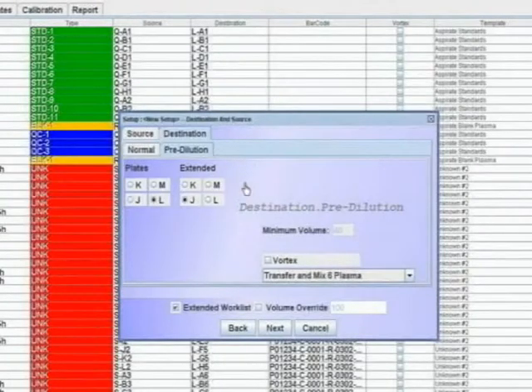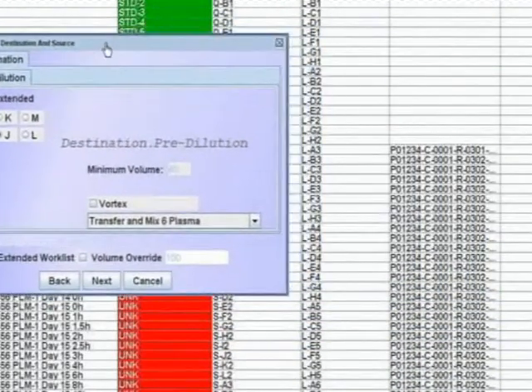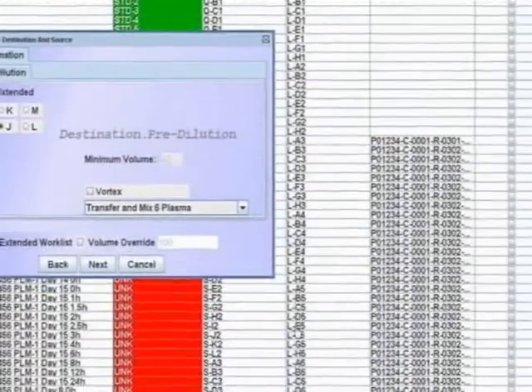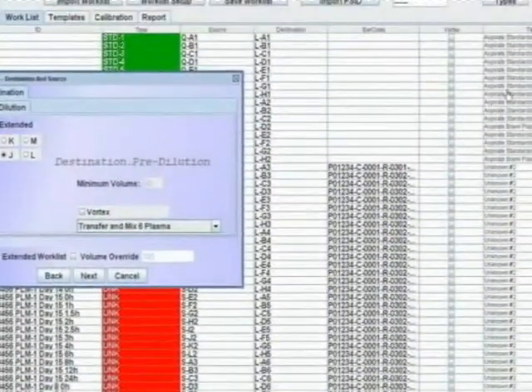Standard 4 is in QD1 in all places. Each unknown has only one source location. That location corresponds to the correct rack location. Another thing to check is that the destinations run consecutively as you have laid out. Lastly, check that the correct pipetting templates have been assigned.